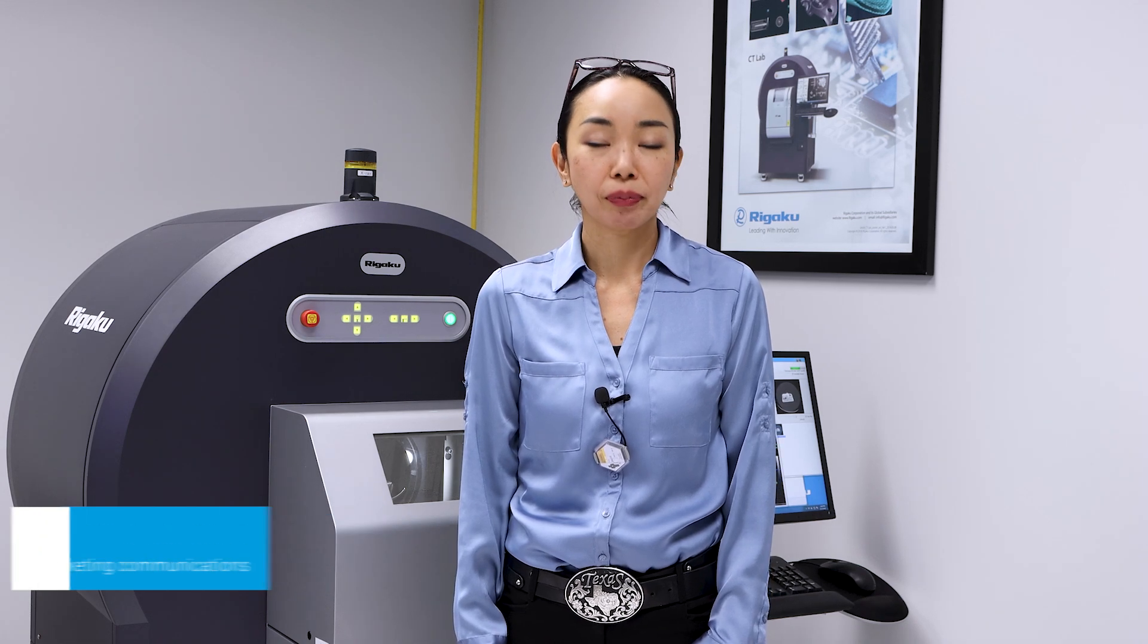I'll show you how to set the sample, how to set the scan conditions, and how to get the results. I'm Aya Takase, and today I'm going to demonstrate our high-speed X-ray CT scanner, CTLAB GX. Let's get started.